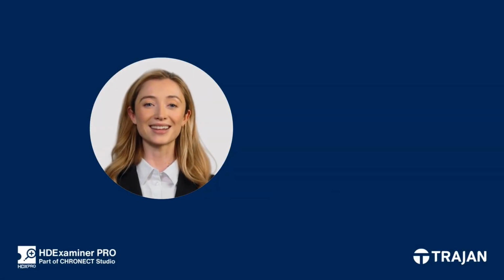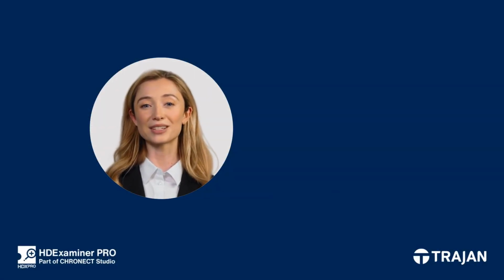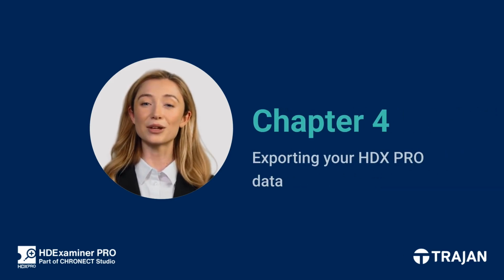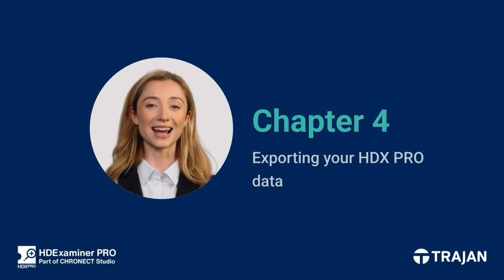That wraps up our look at the kinetics view and how it helps you understand protein behavior by analyzing exchange rates over time. Next, in Chapter 4, we'll focus on exporting your HDX Pro data so you can share your results and perform further analysis outside the software. Let's continue.